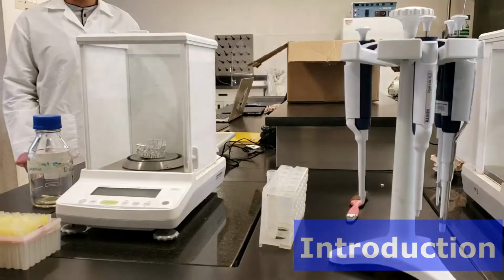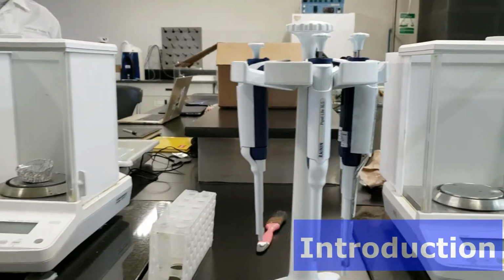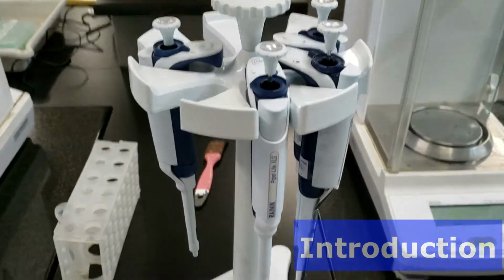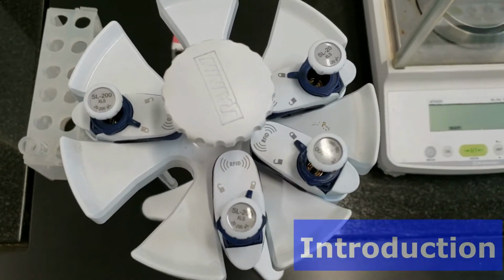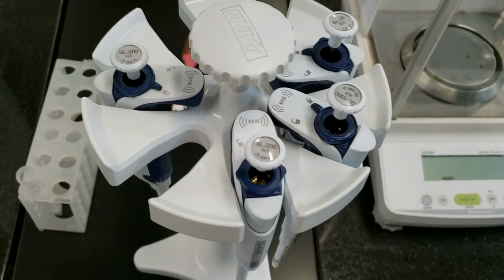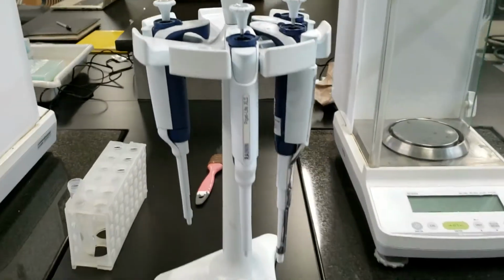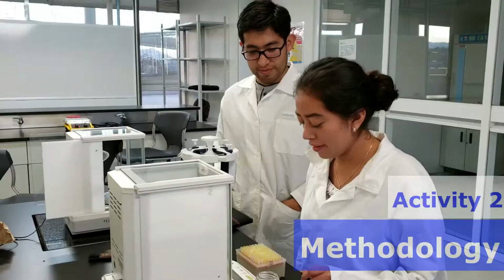This is why the objective of this practice is focused on knowing and securing the genetic engineering laboratory material, starting with how to properly use a micropipette. Micropipettes can be classified according to the volume taken and by their mechanism and purpose. When working with certain fluids, the design of the micropipette employed may contribute to the correct sampling of the volume needed and its deposition. These mechanisms are air cushion pipettes, repeat micropipette, and positive displacement.